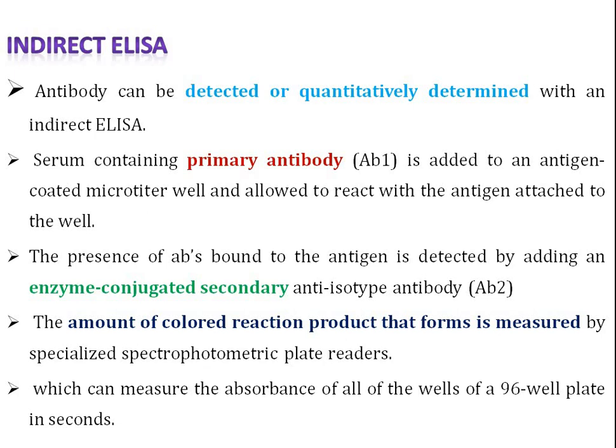Then after, color will be developed. The color formation will be detected with the help of a spectrophotometric reader.